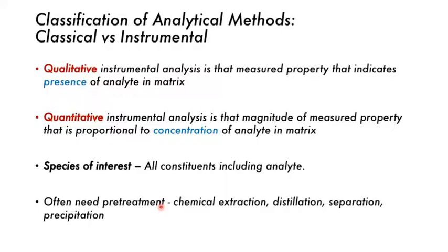Other times the species is too concentrated, so it produces strange artifacts in our measurement. So we have to dilute in that case, but we have to take accurate accountability for each step that we do and make sure that we record the masses before and after any operations, so that whenever we go to give the final answer, we are consistent with the original system.